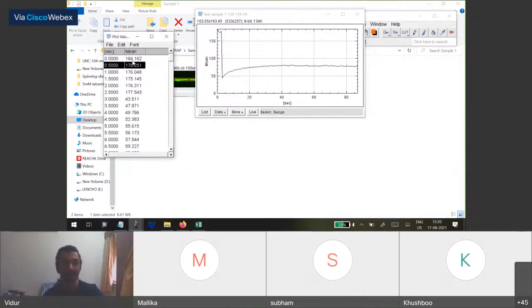And what I had previously done is to manually, in the metadata of the image, set the time scale of my movie. So this is not essential. All microscopes may not automatically do this. If your microscope does not support automatic output of the time, you'll have to manually do this in the Excel software.